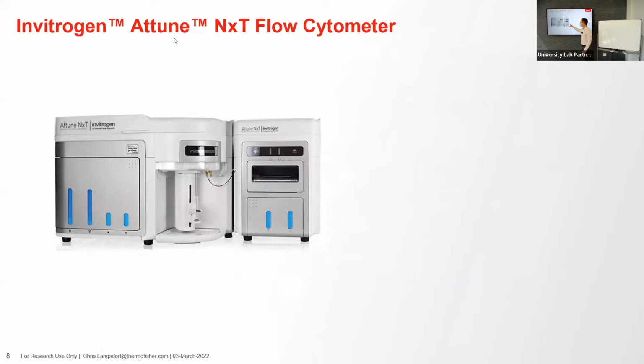So this is what you have on site. And is this the same auto sampler that you have? Yes. Okay. And so this one, you can take a tube of cells. It takes about 4 milliliters of fluid, cells in suspension, and put it on here, and it will analyze them for you. Or you can take a 96-well plate and put it in this carousel, and it will automatically analyze all 96 wells or 384 wells. And so you're able to screen with this instrument also.